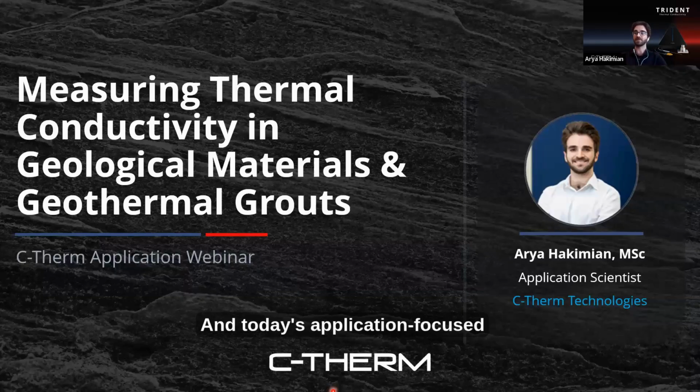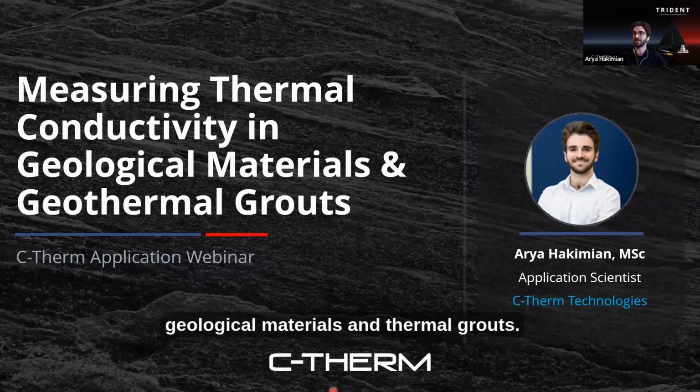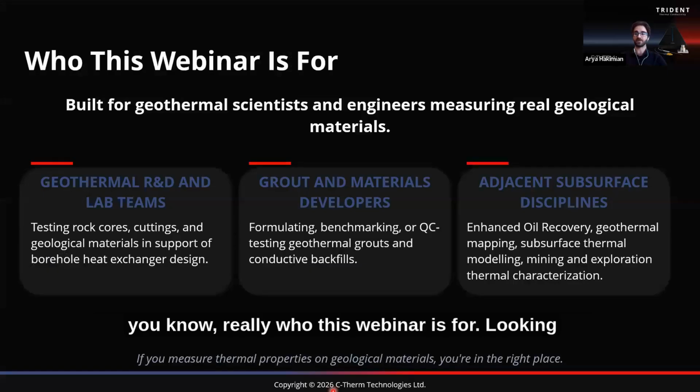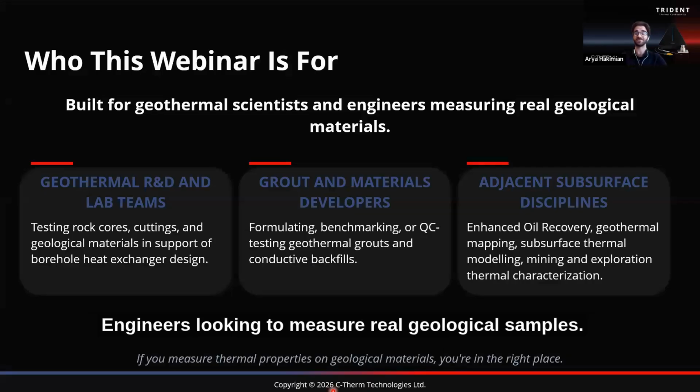And today's application-focused webinar will be taking a look at measuring thermal conductivity in geological materials and thermal grouts. So jumping right into it, I wanted to put a little message out there about who this webinar is for, looking at different areas of application that would be relevant to geothermal scientists and engineers looking to measure real geological samples.